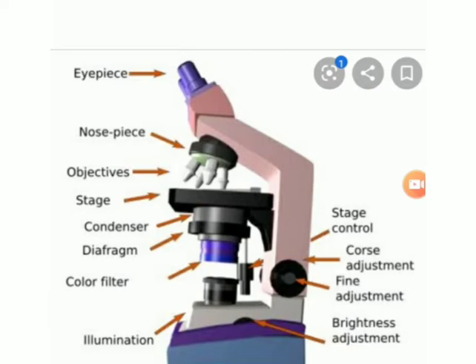Under the 4x lens we see the whole tissue. For example, in skin we can see the layers: epidermis, dermis, and hypodermis. Then we can move on to the 10x lens to further visualize the tissues, and then we focus on the 40x lens.